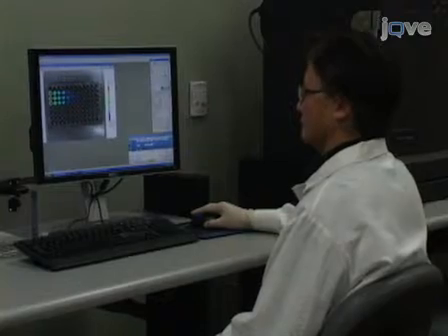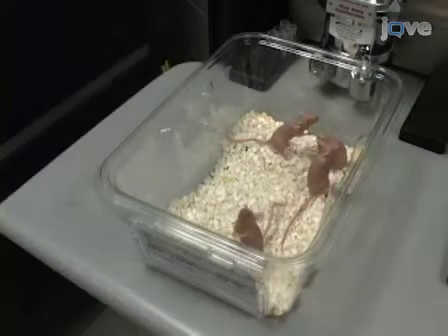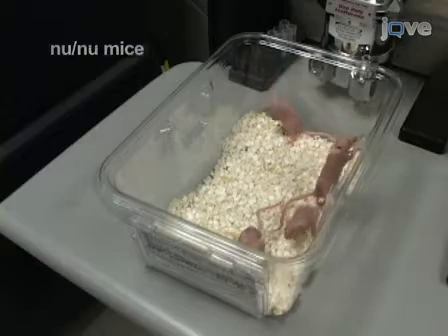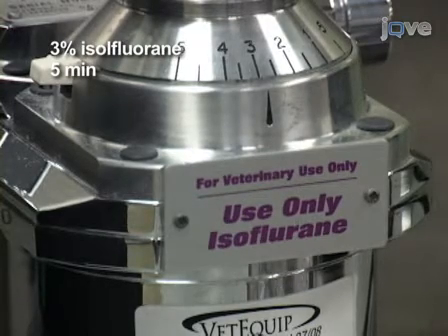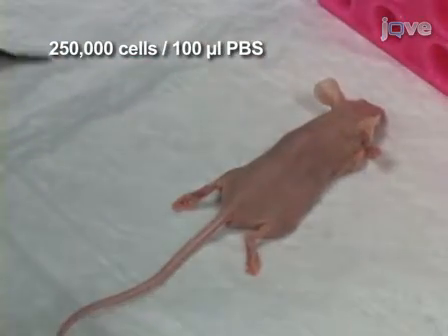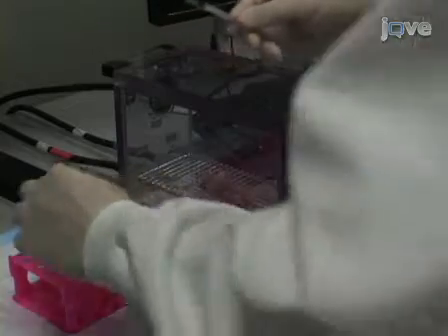Now that we have cells of optimal activity, we can proceed to the subcutaneous injection step. In order to facilitate optimal detection of the tumor, we are using an athymic immunocompromised nude mouse strain. Prior to injection, animals are anesthetized using 3% isoflurane for 5 minutes for deep anesthesia. Next we will inject 250,000 cells in a 100 microliter PBS subcutaneously into the flank. Load the cells in a 1 milliliter syringe and attach a 26-gauge needle.